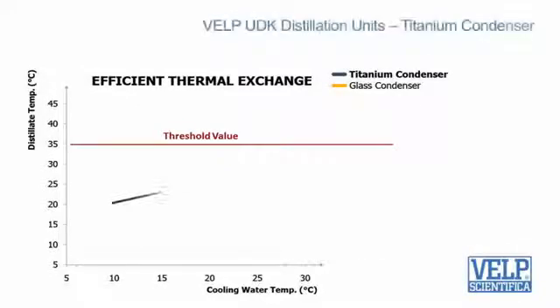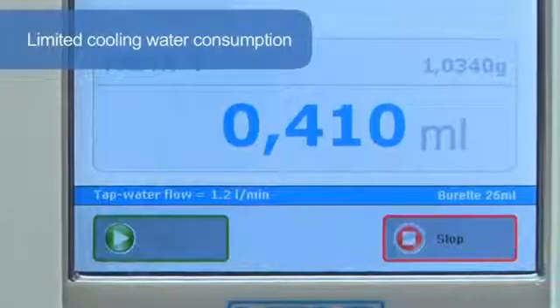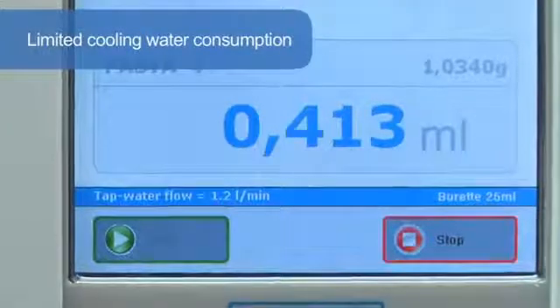The titanium condenser, another patented solution and exclusive key component, guarantees that the distillate temperature always remains below the threshold value for total nitrogen recovery. In addition, the cooling water consumption is really low, starting from only 0.5L per minute.